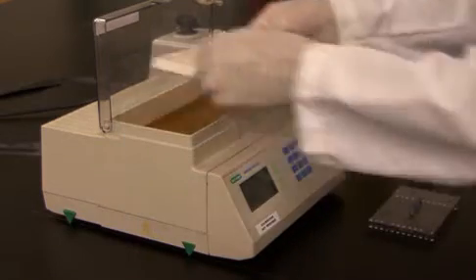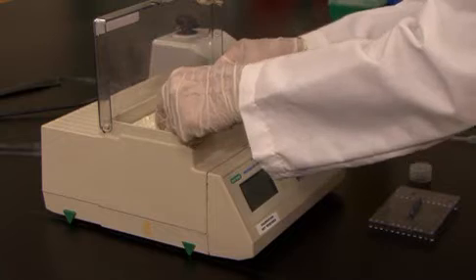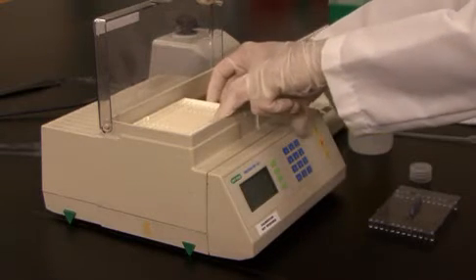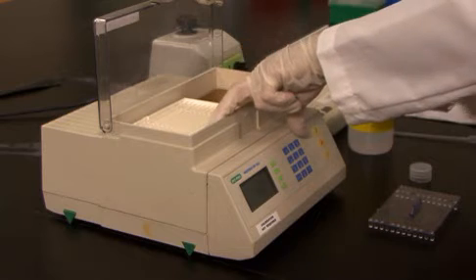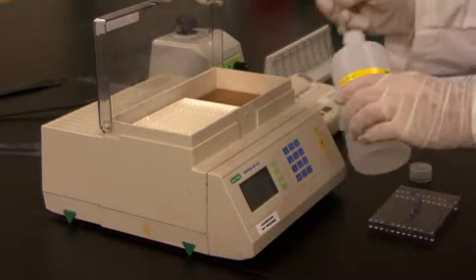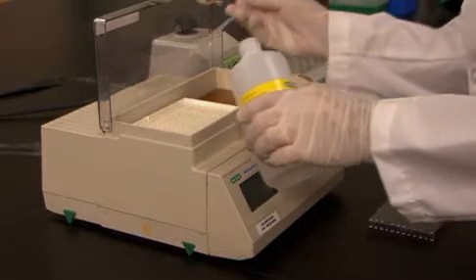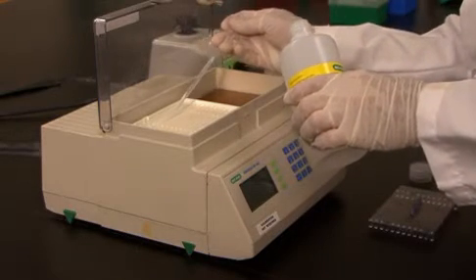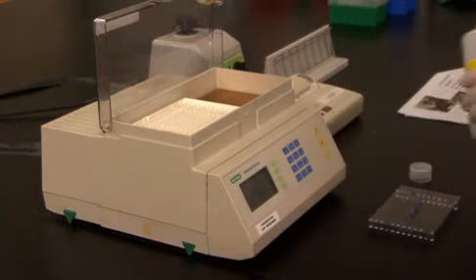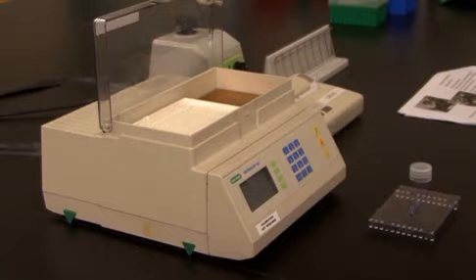Place the focusing tray into the protein IEF cell, making sure to align the positive electrode with the focusing tray with the positive electrode of the protein IEF cell, and add enough mineral oil to cover the strip in each lane. The purpose of the mineral oil is to prevent the strips from drying out during the course of the rehydration and the run.